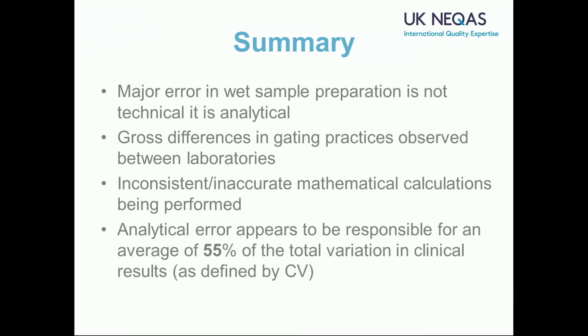And I think what we will do next time, if we start getting these calculation errors and typos coming through, is start following up a little more with the laboratories to see if we can drill down and find out where things are wrong. Is it that the data entry sheet we've designed is not user-friendly? Or is it a genuine issue with the calculations not being made correctly? I think it's probably 50-50. So that's what's going to come your way over the coming year.